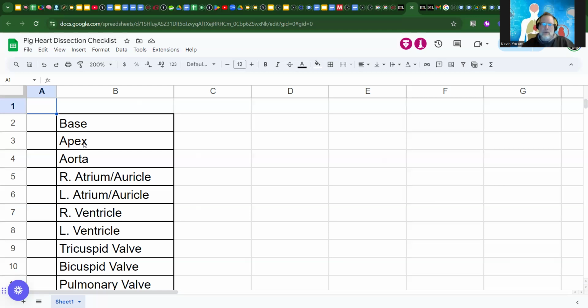And then the other thing we'll notice separating front from back of the heart: the front, or the anterior aspect, is going to be pretty much clear of everything. It's going to be real meaty. Here's a heart right here. We're looking at the front of the heart, and you can see it's basically just a lot of ventricle.